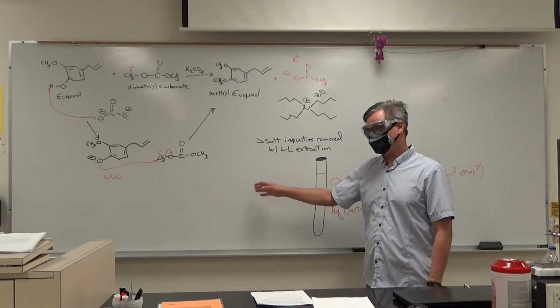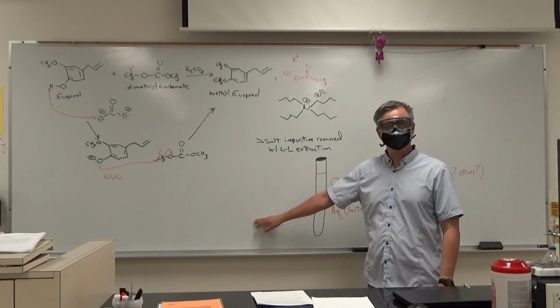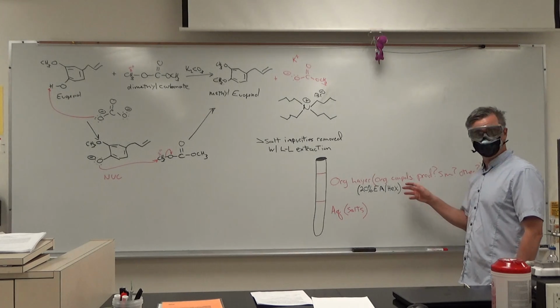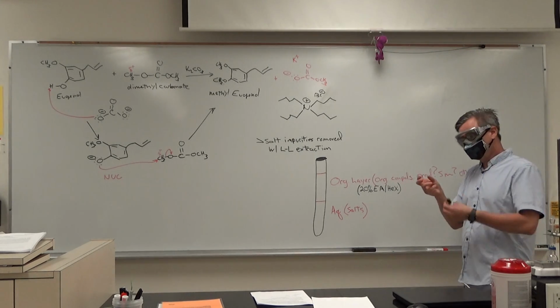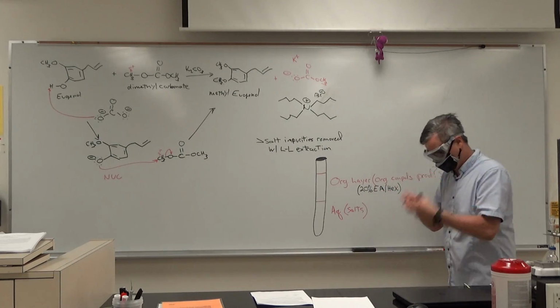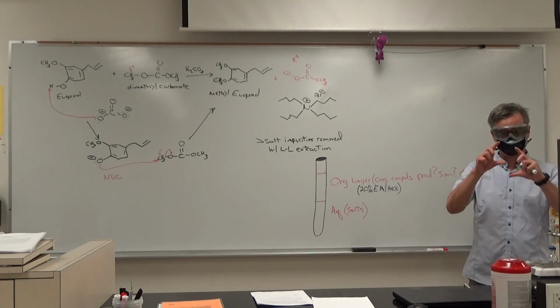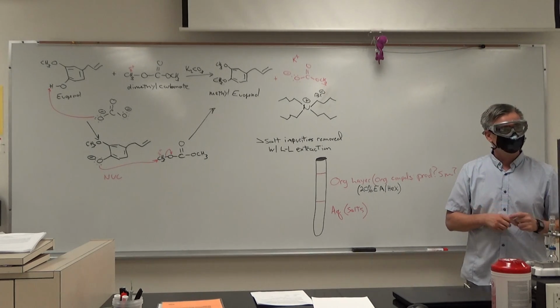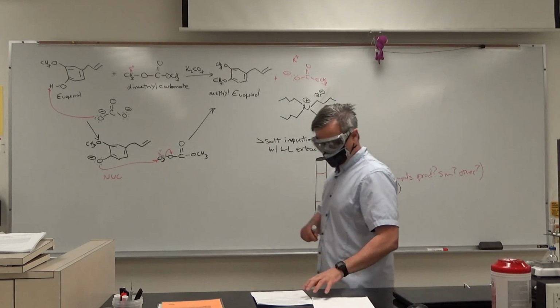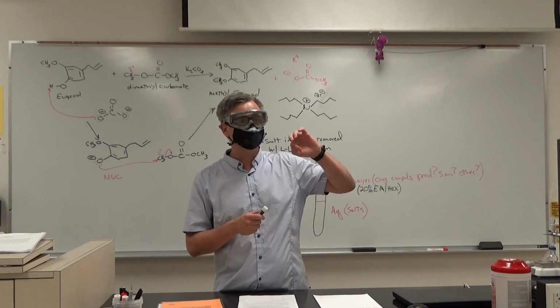And you're going to add saturated sodium chloride to that. We do that because, strangely enough, this organic layer will end up having a little bit of water mixed in it. And if you combine it with sodium chloride water, all that water that's trapped in here goes to that. So it actually helps dry that organic layer. But it doesn't dry it enough. So we get that final drying of the organic layer by putting in a little bit of magnesium sulfate.